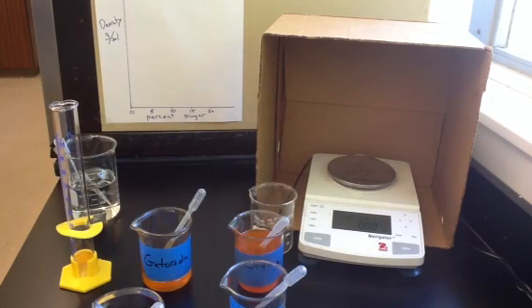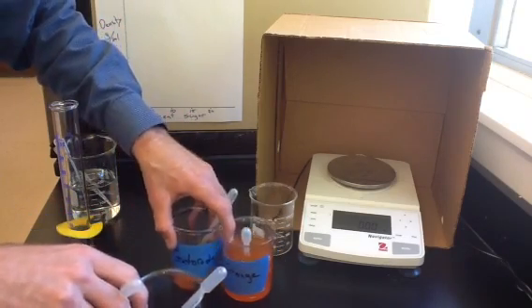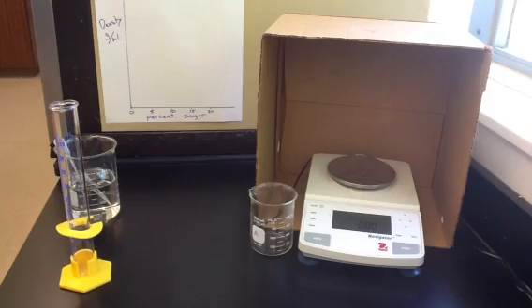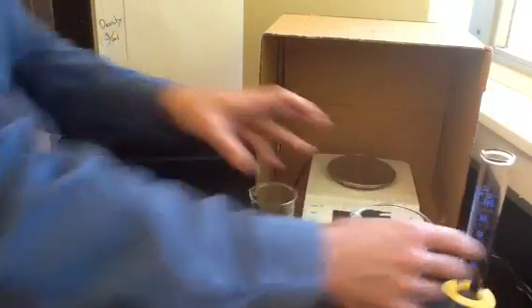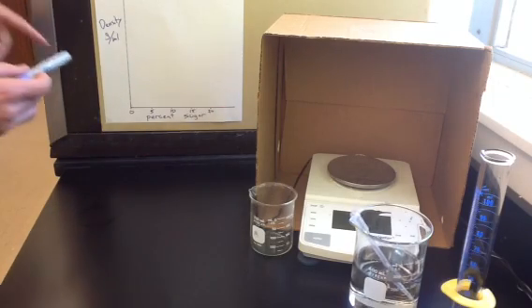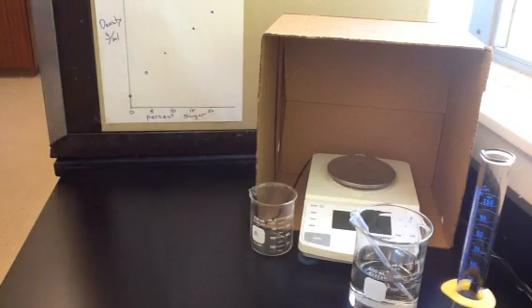In order to do this, we're going to be measuring their density. Density is closely correlated with sugar content. Sugar adds density to a solution, and so the more sugar a solution has, the higher its density will be. In order to find the sugar contents of the various sodas, we're going to first measure some standard solutions. So we have standard solutions that are 0, 5, 10, 15, and 20% sugar. And what we expect is that as we increase the sugar content in our standard solutions, the density will increase.